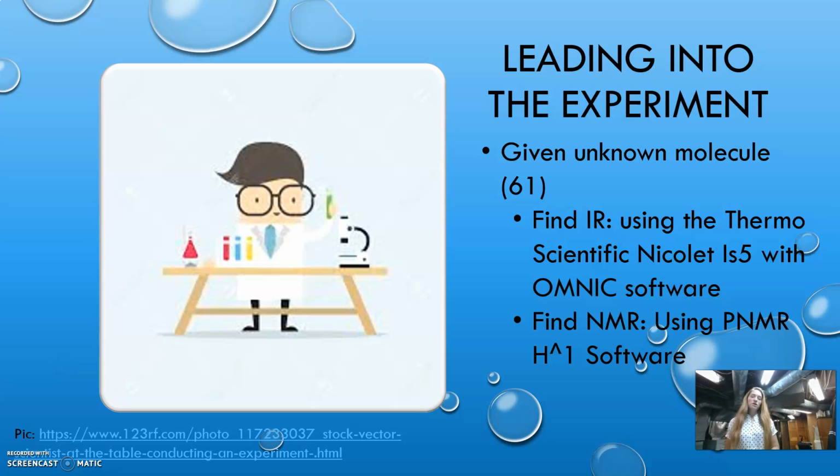Leading into our experiment, our professor gave us an unknown compound. For me, I got unknown compound 61. And we were able to use IR and NMR spectrums. For the IR, we used the Thermo Scientific Nicolet iS5 with OMNIC software. Then, for the NMR, we used the H1 NMR software.